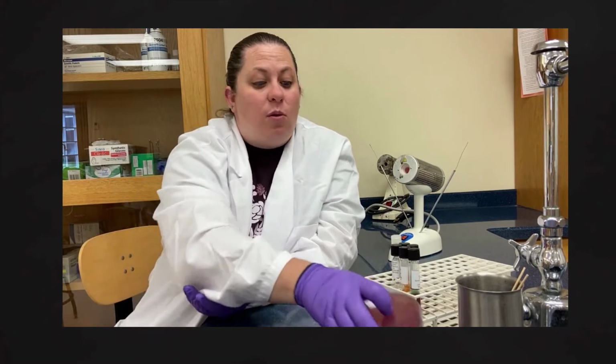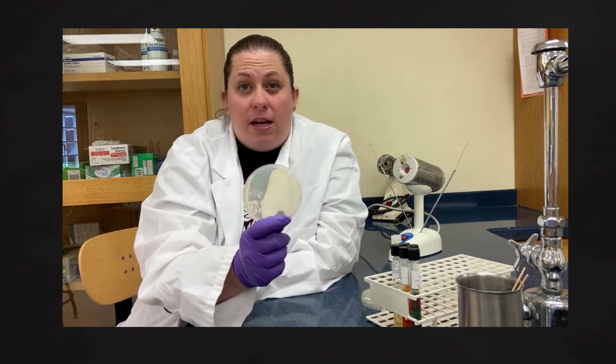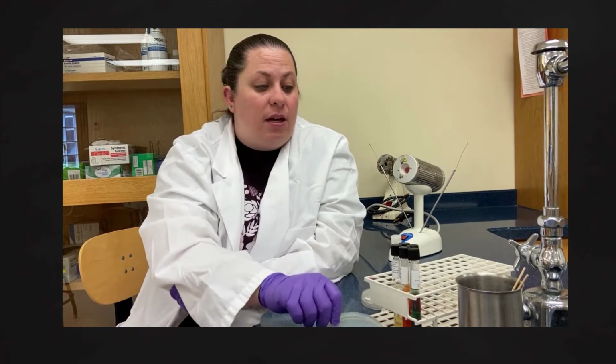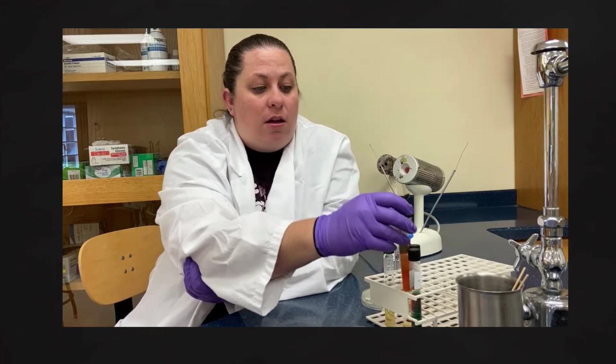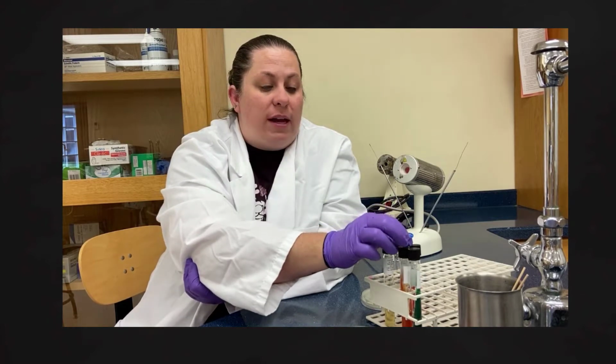Now, sometimes when we look at these, some of these plates or these agars or broths are going to be what we consider non-selective. A non-selective type of agar is going to allow pretty much anything to grow on it. Okay, and so this would be like nutrient agar, like we see here. This may also be like a nutrient type broth that's going to allow a lot of things to grow in it.